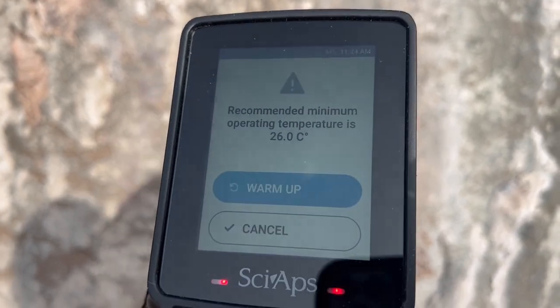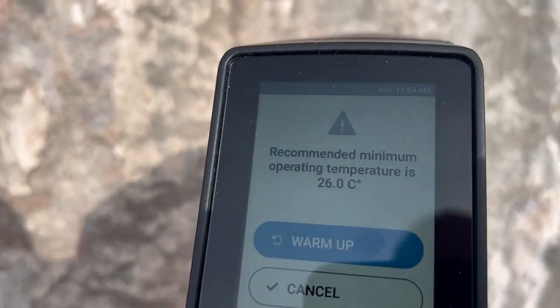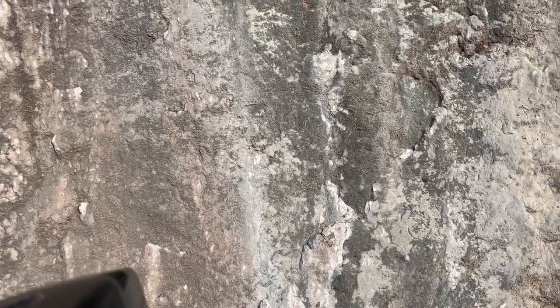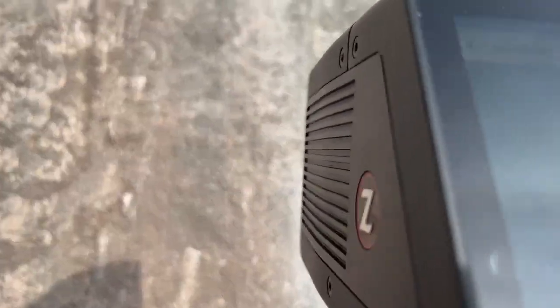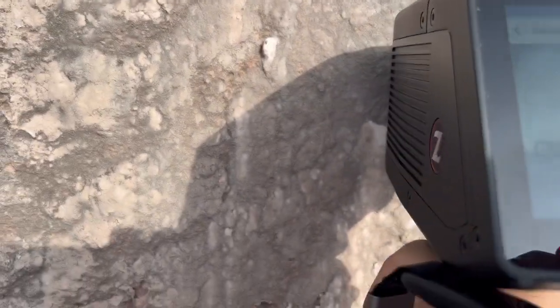Prior to doing that, you do have to make sure the device laser is at temperature. The warm-up takes about 20 minutes. We're at something like the high 40s here in Arizona in the morning, and it wants to be around 80 degrees. So we normally will warm it up — I've done that 20 times just to get us close to spec.